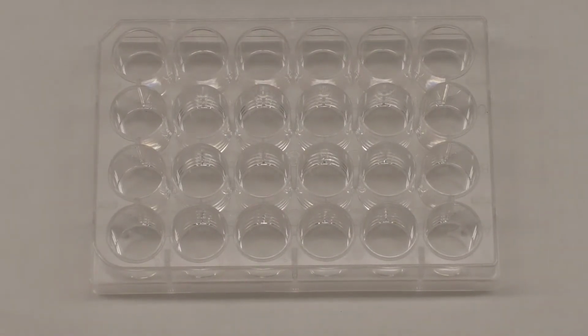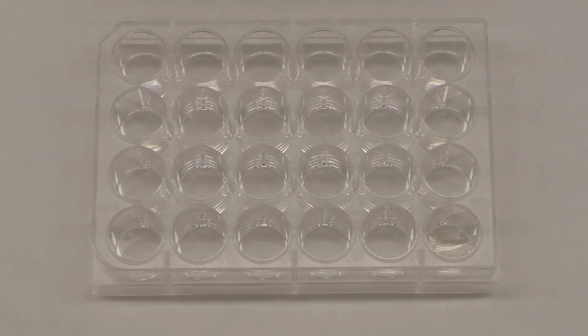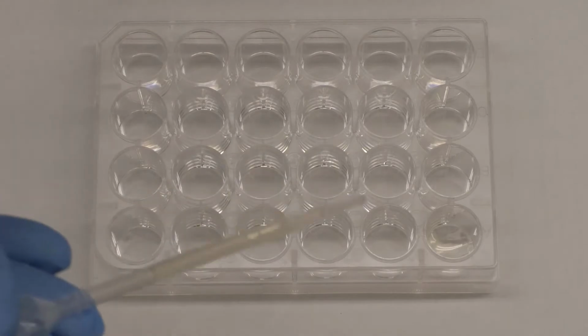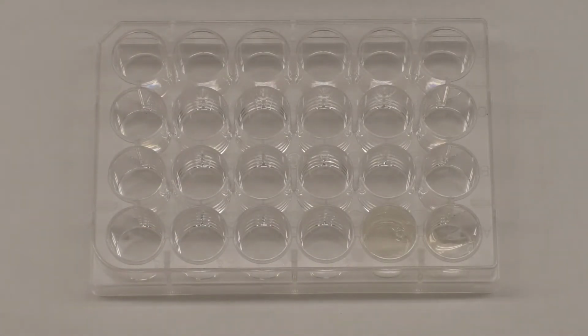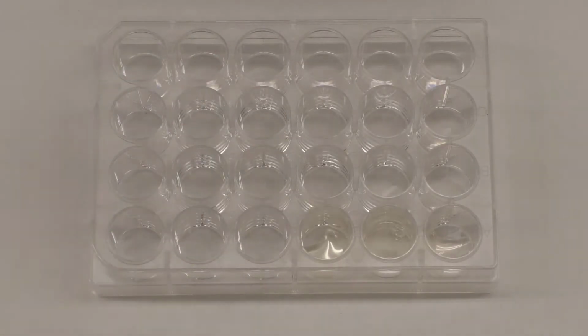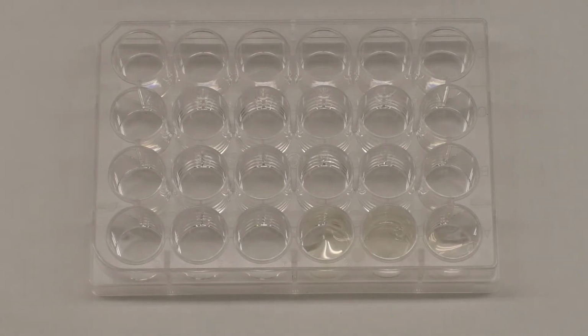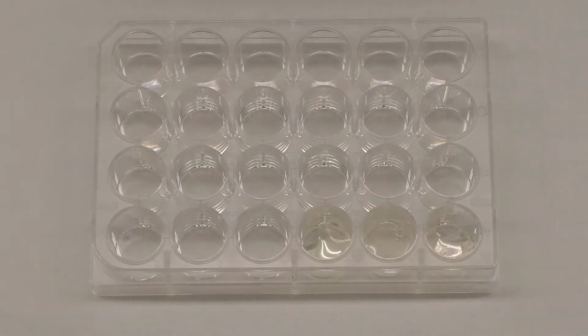So let's sample some solution from each of our cultures. Pseudomonas aeruginosa, we just looked at the nitrogen gas. Staph aureus. And Bacillus subtilis. So, it's a 2-reagent reaction.